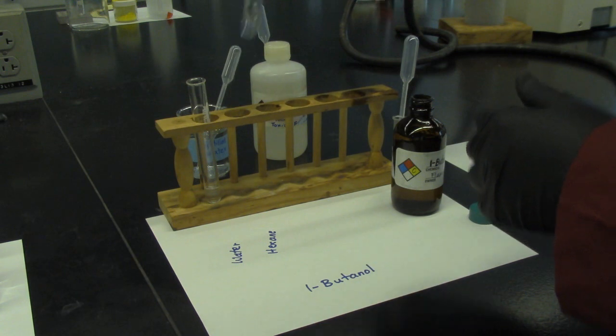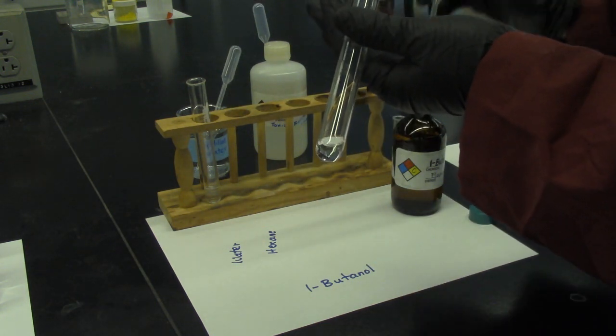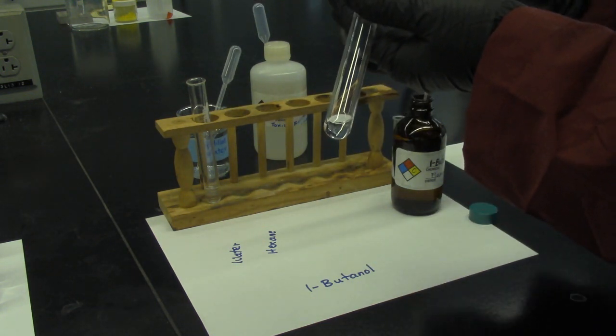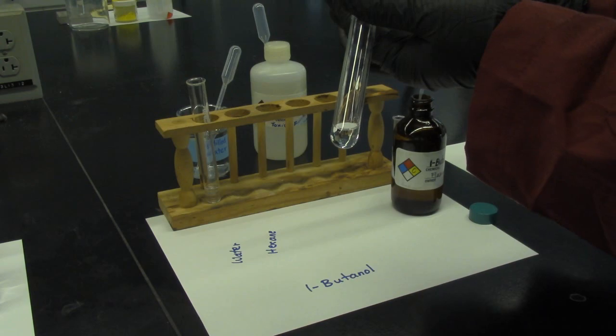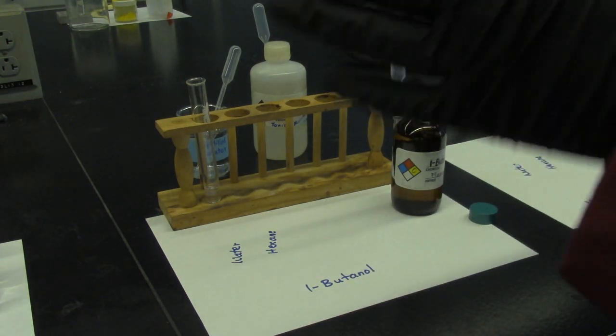Okay. Second test tube with 1 ml of hexane and a few drops of 1-butanol, 1, 2, 3, 4, 5. Shake it.